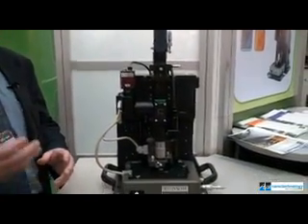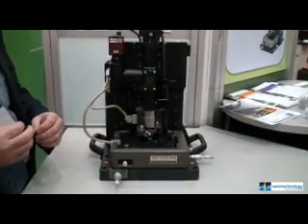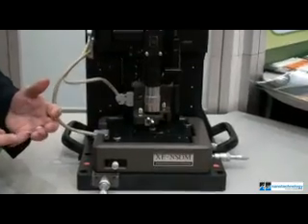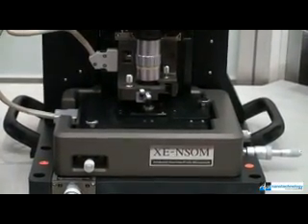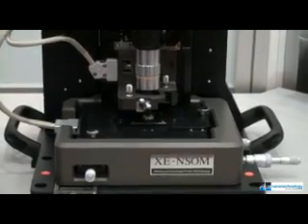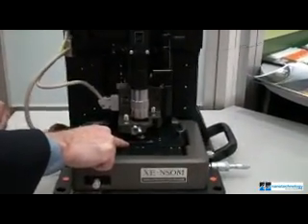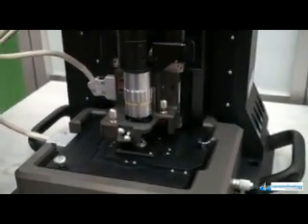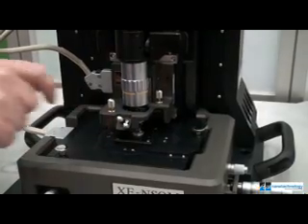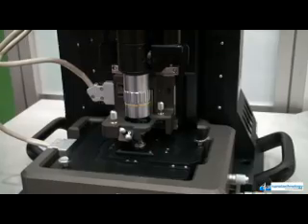All of their platforms utilize the same decoupled XY from Z scanning. The benefit of the decoupled scan system is that your sample is scanned in the XY direction with a flat background on the XY stage. The Z scanner, where the tip is mounted, comes down normal to the surface, and the tip only moves up and down to scan the surface.